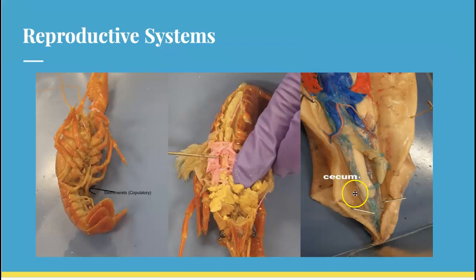As for squids, male squids have a penis. As you can see, we had a male squid right here. You can tell by the testes. Male squids release a spermatophore, which contains sperm inside, into the female squid's sperm receptacle. Once the cap of the spermatophore is removed, the sperm is released inside the female and it fertilizes her eggs. For both the crayfish and the squid, fertilization occurs internally, but gestation occurs in different forms.